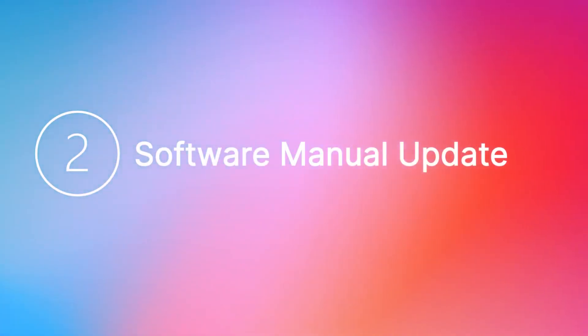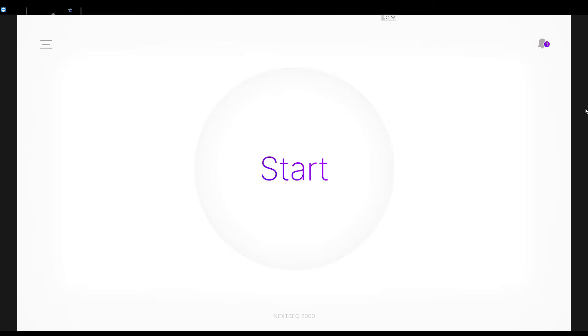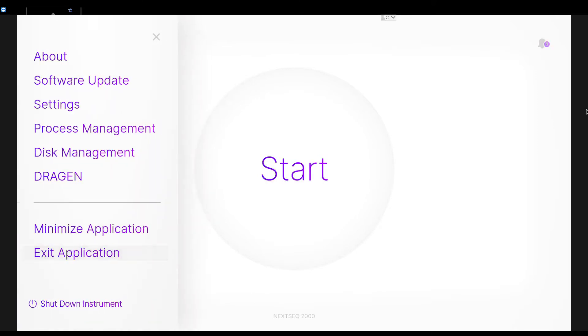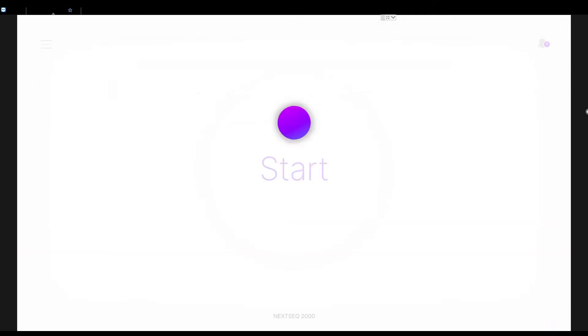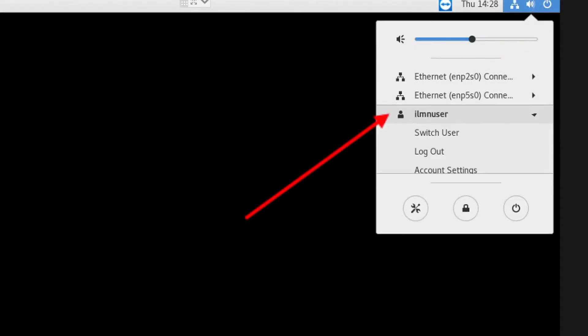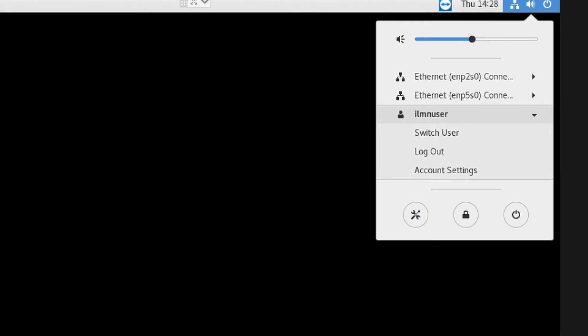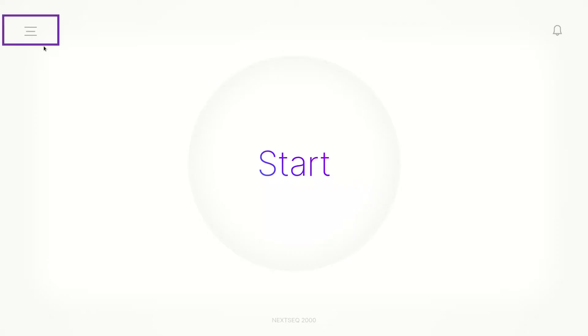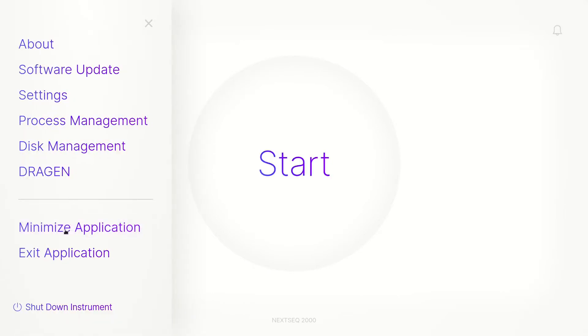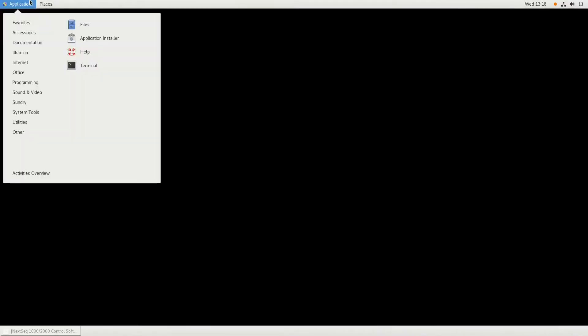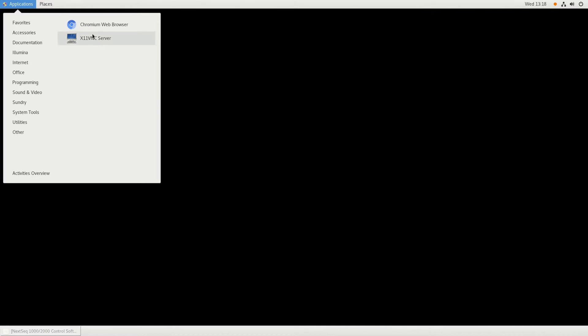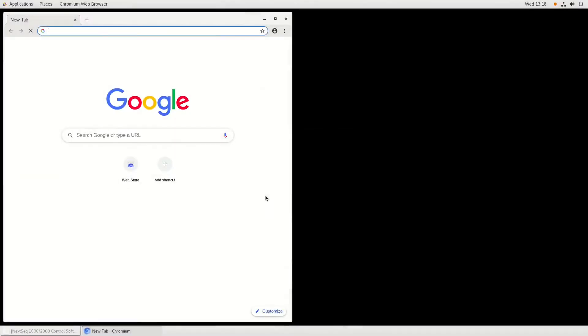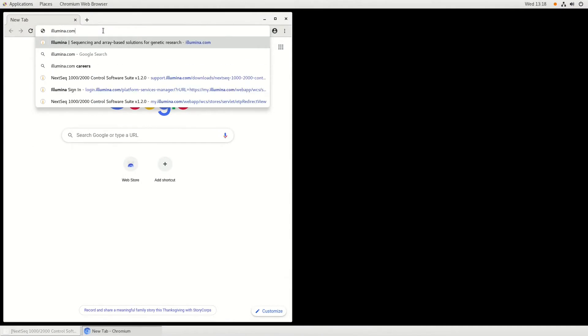To update the software manually, follow these steps. First, ensure you are logged into the Illumina Admin account. If you are logged into the Illumina user account, sign out and switch to Illumina Admin. Either on the instrument or a separate PC, open the Chromium browser. If a dialog box opens, select Cancel and navigate to Illumina.com.